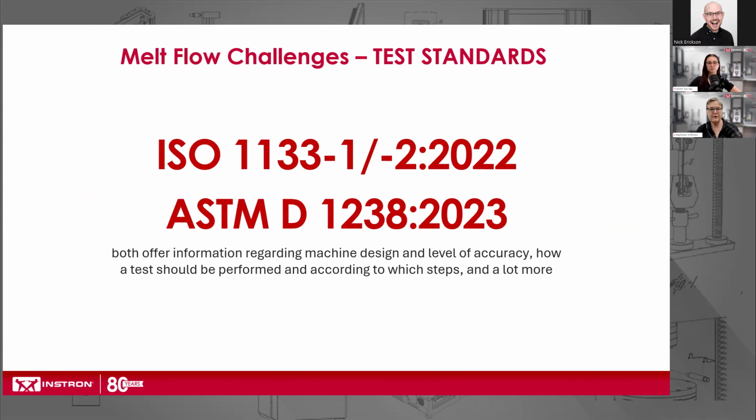The biggest challenge is make sure you read your standard. The tests look the same, but the standards themselves have differences in them, and you're going to want to make sure you're following the right standard and the right method.